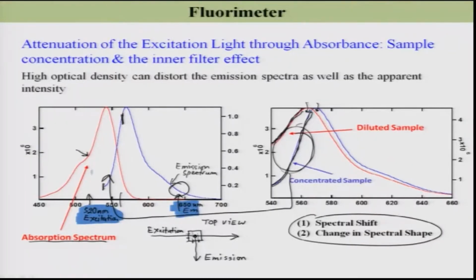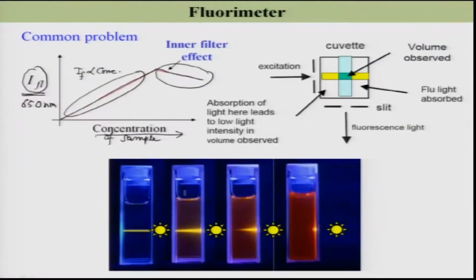So, here I am exciting and here I am monitoring, okay. And that is what I am going to do over here, 520 nanometer excitation and 650 nanometer emission. Still what I am going to see is an increase initially, but then a decrease, and that can be explained with this photograph.